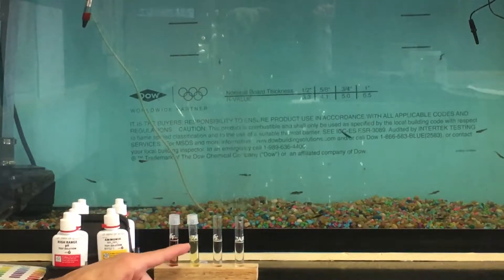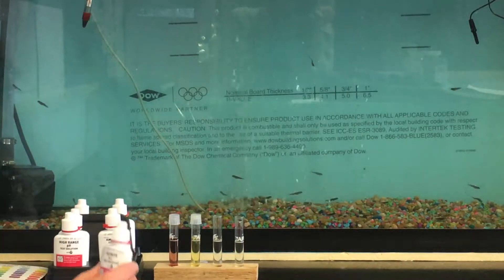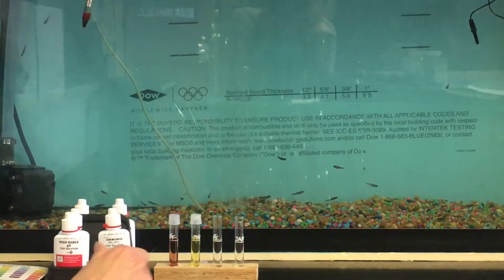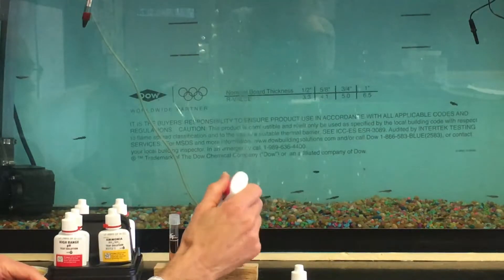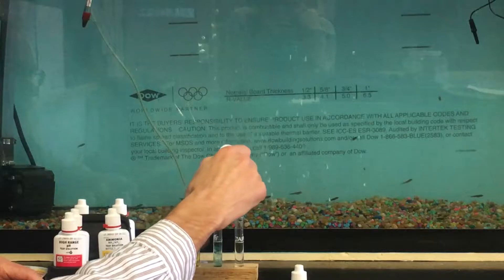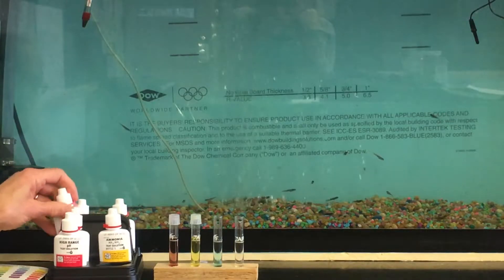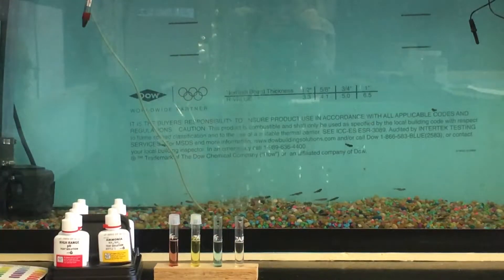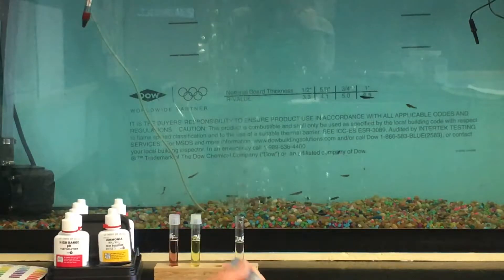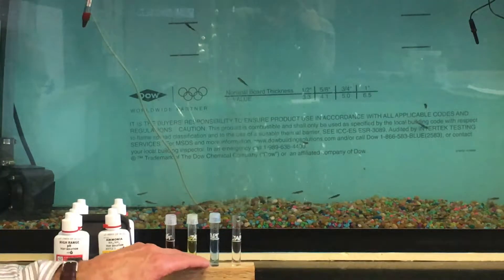We have to wait five minutes for the color to develop on the ammonia test tube, so we move on to the next test — nitrite. Nitrite uses a single test solution, and we add five drops into the test tube: one, two, three, four, five. That one also needs to be shaken for five seconds, and then we wait five minutes for the color to develop.